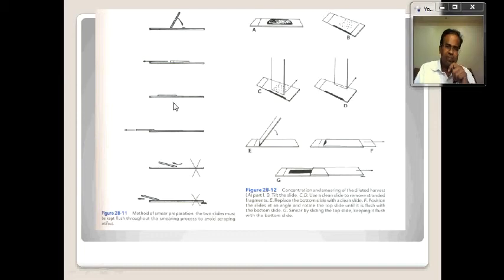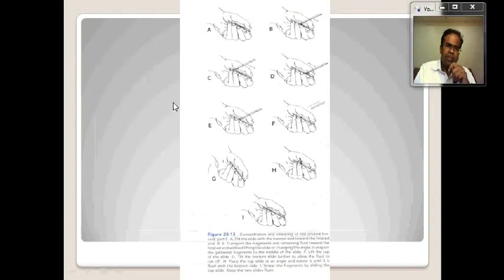And then if there is too much liquid aspirate, it can be drained off by tilting the slide to one side. When the particles remain on one end of the slide, they can be spread with another spreader slide. So this is how we can do FNAC by the aspiration and non-aspiration technique, and spread it properly. Spreading is very important. I hope these diagrams illustrate the same things beautifully.